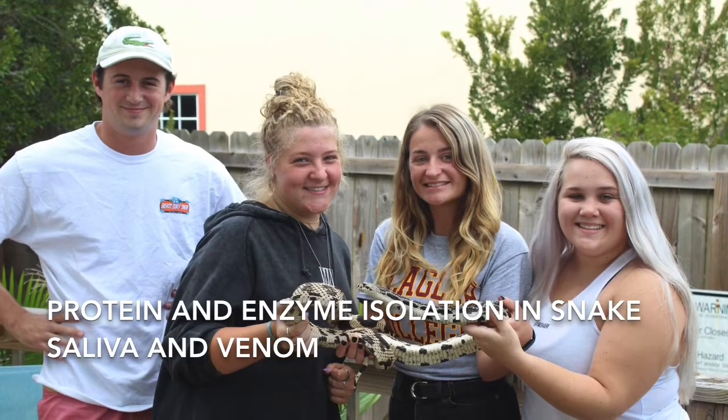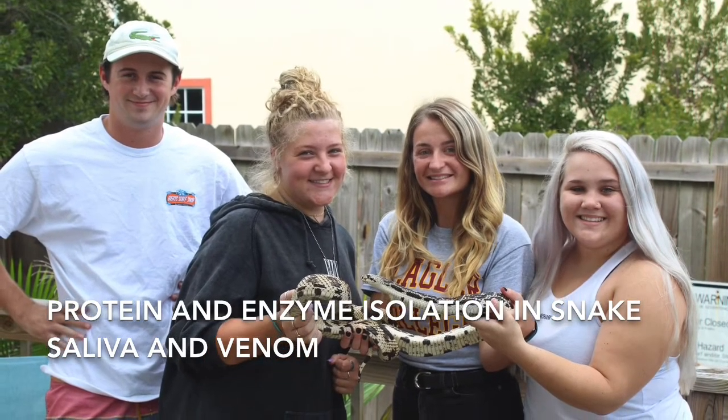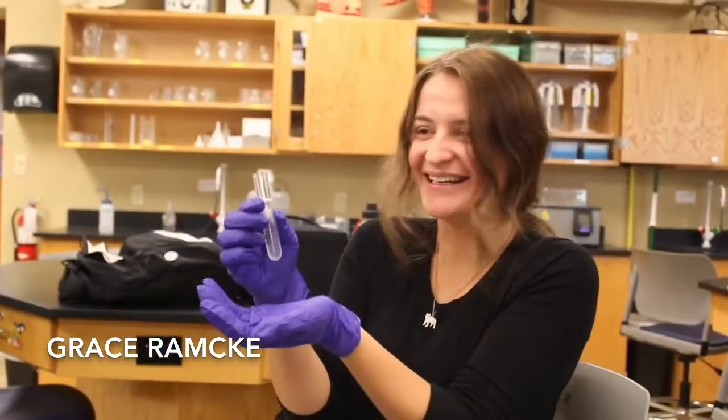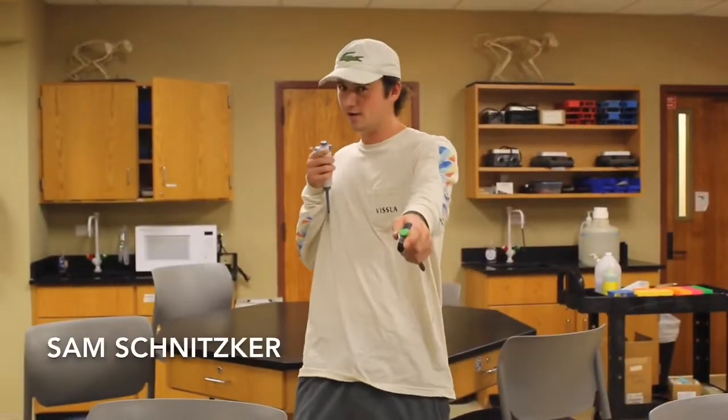Hello and welcome to our Coastal Field Research Capstone Project video. This semester we have teamed up to isolate and compare protein and enzyme components in snake saliva of non-venomous snakes and venom from well-known venomous species.